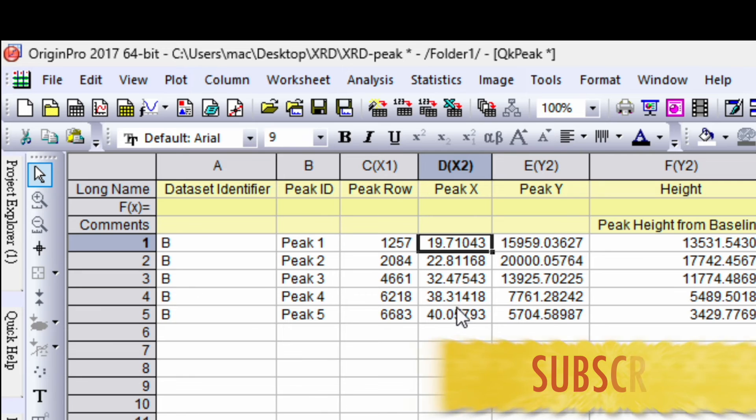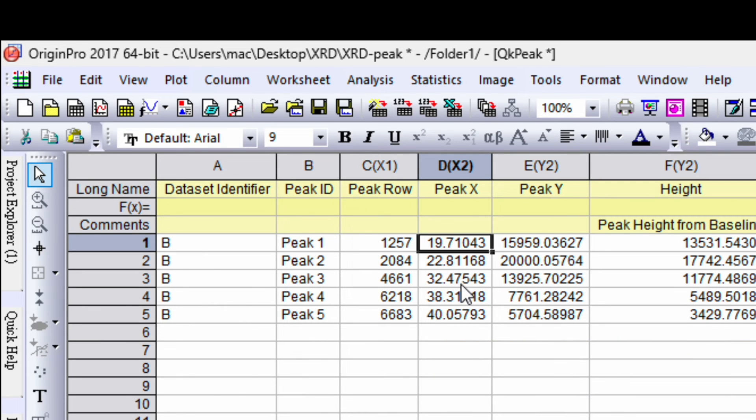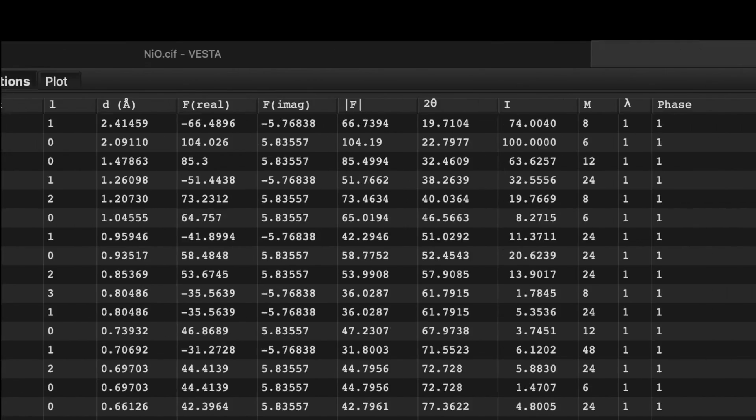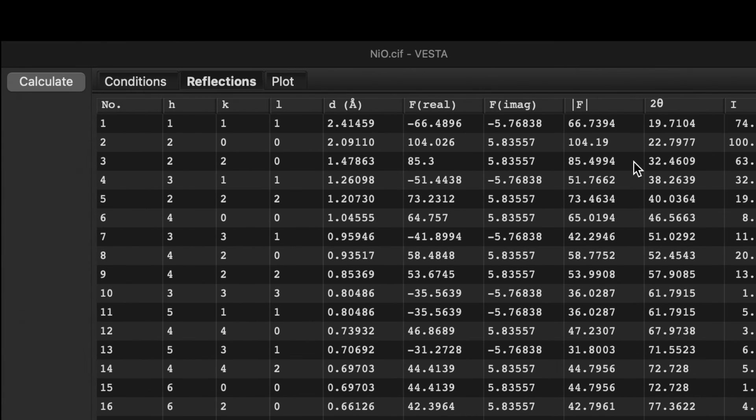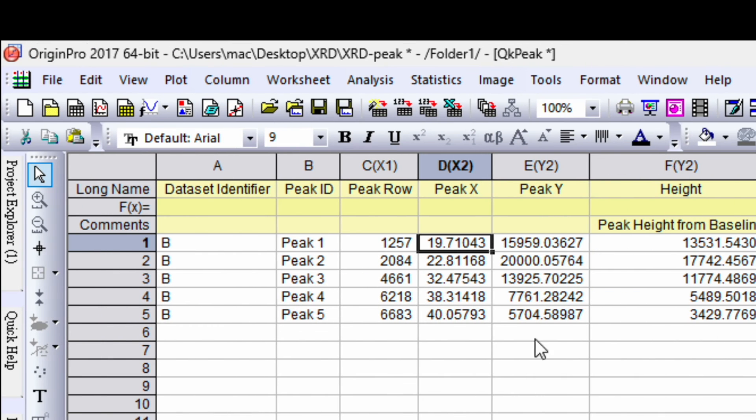You can match with some other numbers like 22.81. This is the second peak then 32.47. So let's go back. It's 22.79 close to 22.8, 32.46. Then it's 38.26 and the last one is 40.03.